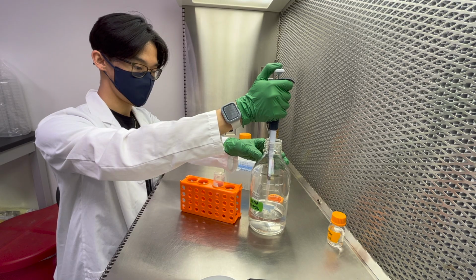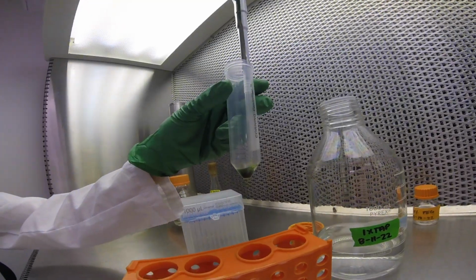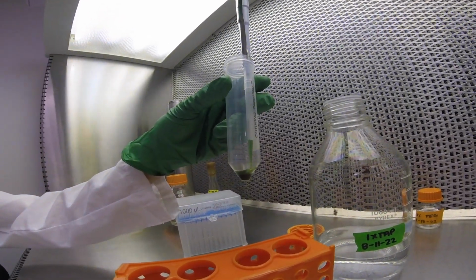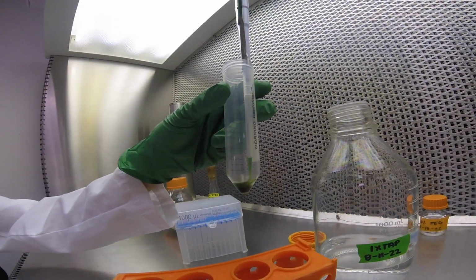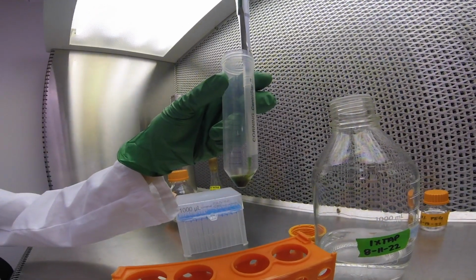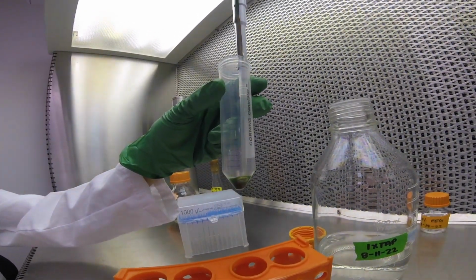4. Resuspend the pellet in 1/100th volume of tap gently. If using 50 ml of cells, for example, resuspend in 500 microliters of tap, or 0.5 milliliters of tap. Avoid excessively agitating the cells by slowly pipetting up and down.